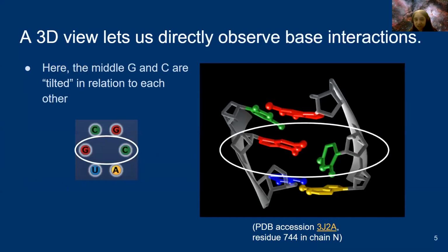Long story short, Nando saw that if you looked at the 3D view, then you could see that basically the bases, instead of being nicely lined up with each other, one of them was tilted kind of funny.